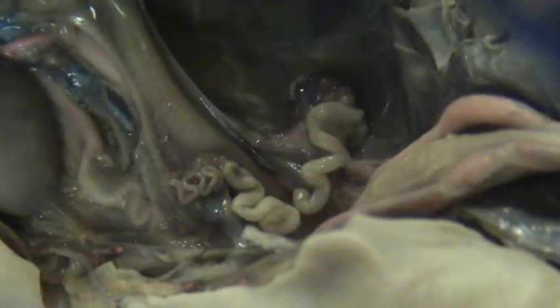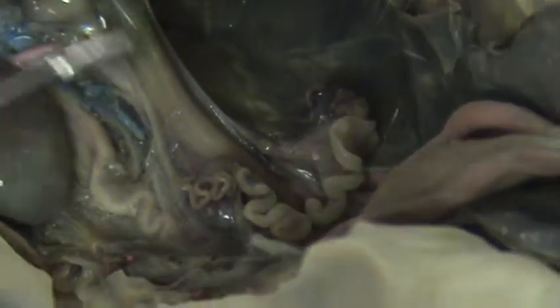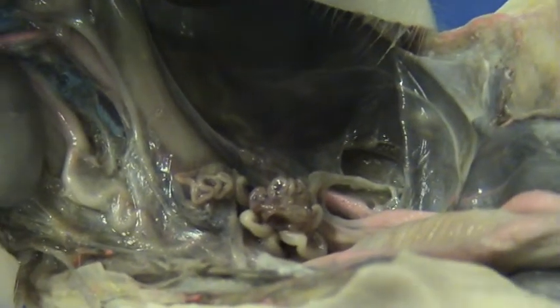Excuse me. Iliac, arteries and veins. Surprise. Because I always forget them, but that looks like one of them right there. Going down to the hind legs. What is that? Iliac. The iliac artery, yeah, starts right about there. What does that do? Okay, the pink thing right there? Yeah, the arteries taking blood to the hind leg, the veins draining blood away from the hind leg. Okay.